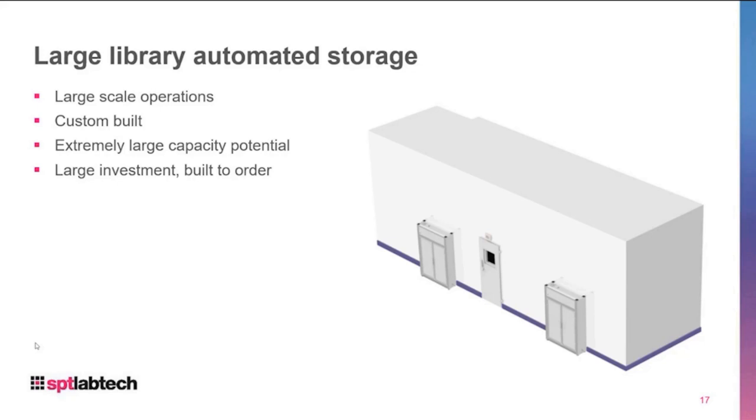These usually come with a lot of flexibility in the design, but it's a high-end investment and difficult to get into buildings. They have to be built on site, so it takes quite a bit of time to get them up and running. Once they're running, they're essentially, as shown, a large room. They're not mobile, and they can't scale as your business changes. It's a one-time purchase in this case.